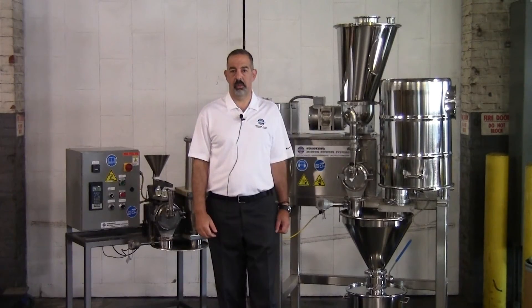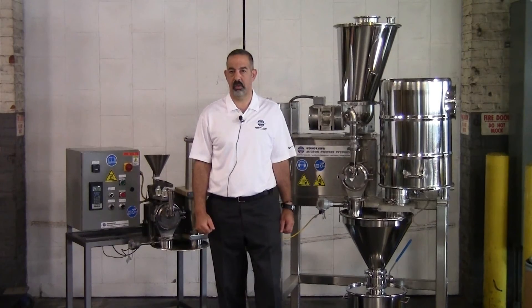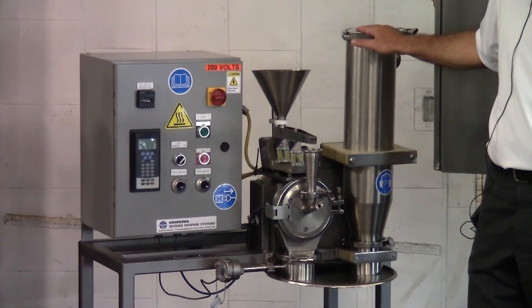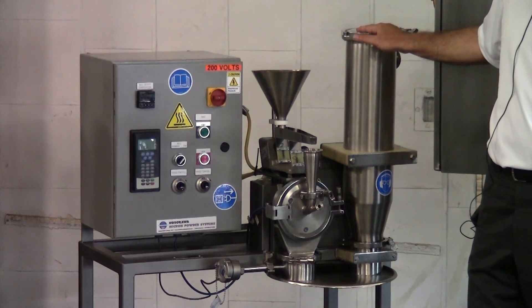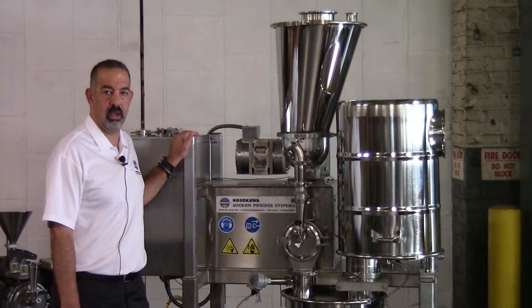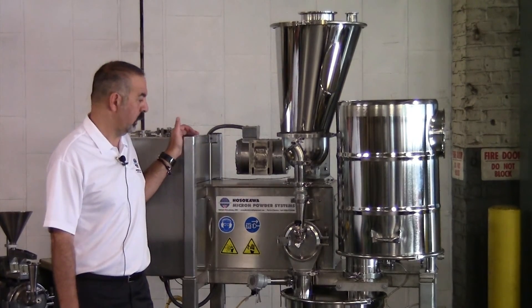I hope we were able to show you the level of customization we can do here at Hosokawa Micron Powder Systems — from what you see on the right, the Universal Micro-Pulverizer Model B standard design, up to our advanced version for a specific pharmaceutical customer based on their requirements.